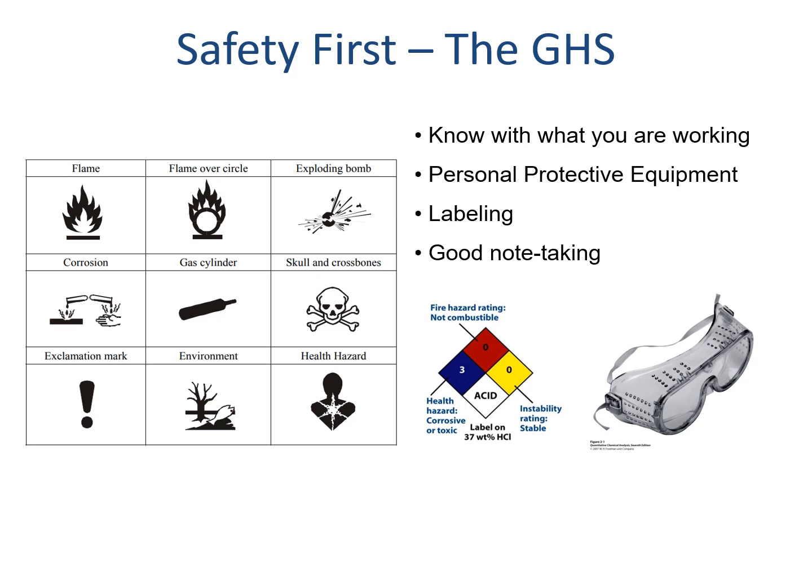The hazard label on the top right is an exploding bomb, indicating something is unstable or self-reactive. Generally, I avoid these even in the advanced labs. These need particularly special care. Although on a side note, one of our graduates works to test chemical hazards like flammability and temperature stability. So it's not to say that we don't prepare you for special handling.